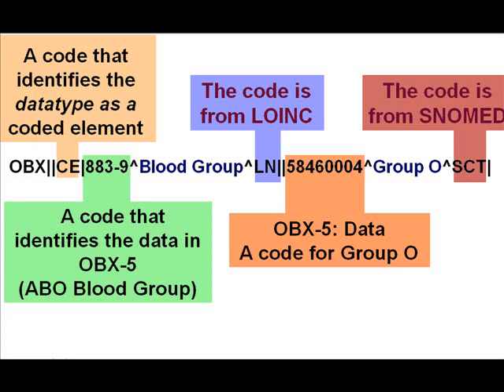The approach, ideally, to how we make LOINC codes is to gather codes from people who are actually already using the information in an electronic medical record system or in a clinical information system of some kind. So, for instance, when we started back in '94, we gathered things up from Intermountain, from the VA, from Regenstrief, Mayo Clinic, from 3M and their customers, from a bunch of the commercial laboratories, and got their test libraries and said, these are things that people are really using.